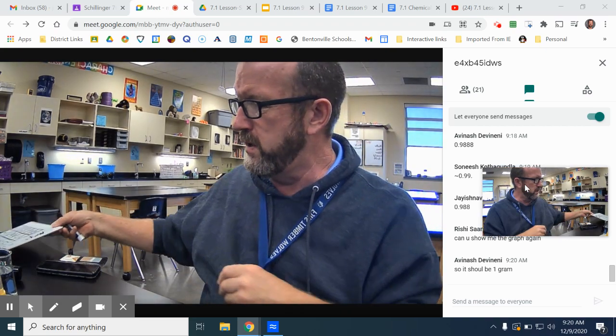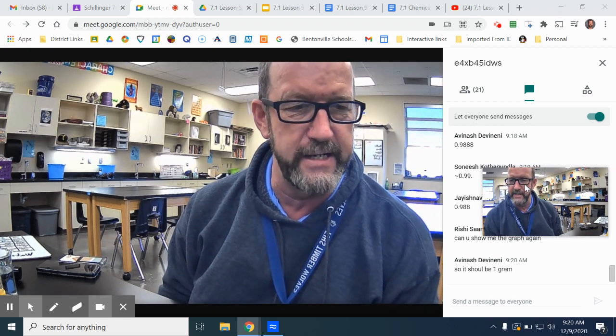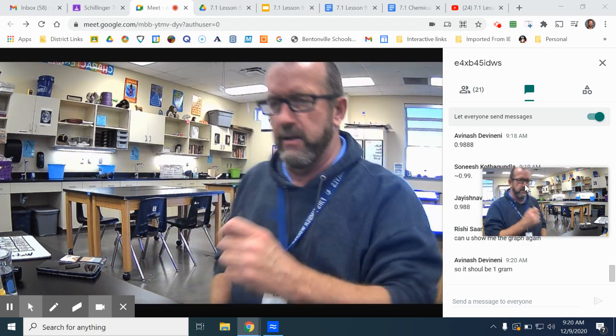According to science, yes. You should have exactly 1, the density of 1 every time. So just for fun, can we put in 1 gram of water and see what happens? Not with this scale. Hold on 1 second.